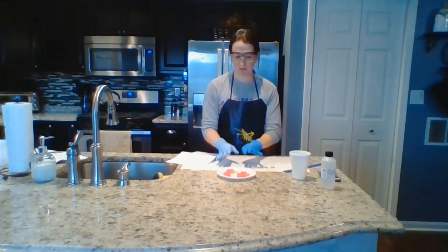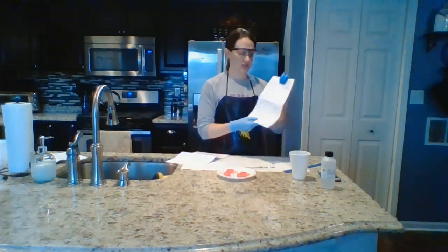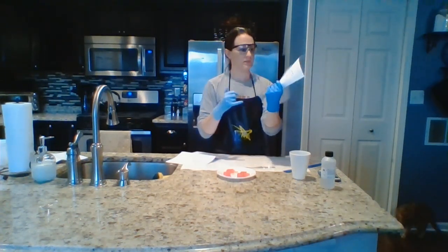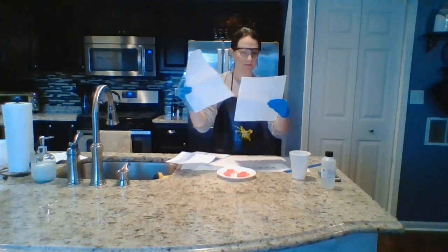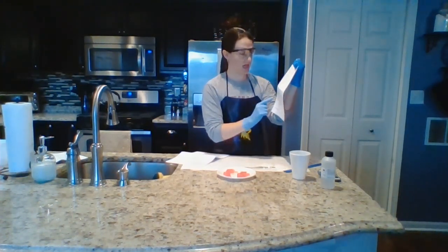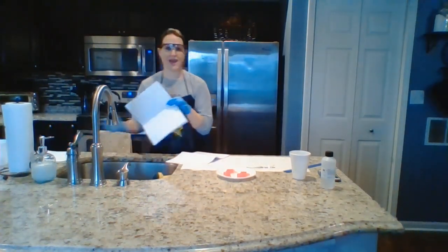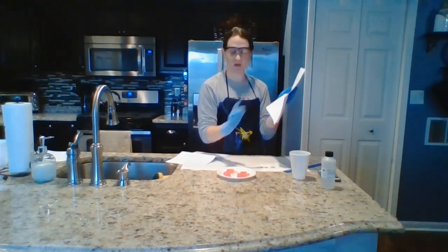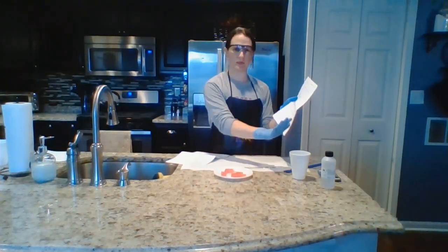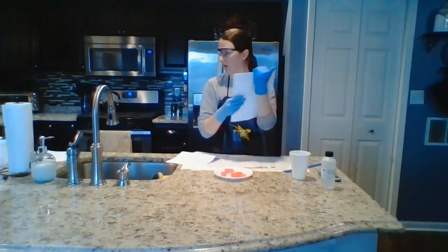So, after I've prepped my agar, the first thing I'm going to do is calculate surface area of the cubes I already have. So I'll follow the example data table in my student guide, and I'll fill in data table 1, 2, and 3 for cube 1, cube 2, and the cube that's 2.5 centimeters in size. Then, before I do anything more, I will also record my observations of how these agar cubes look right now before I add vinegar to them. So I'll fill in number 2 in my analysis questions on my lab as well.